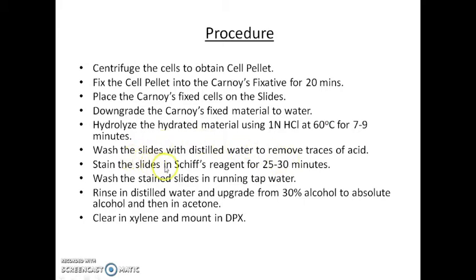After that, we stain the slides in Schiff's reagent for 25 to 30 minutes. Wash the stained slides in running tap water, rinse in distilled water, and upgrade from 30% alcohol to absolute alcohol and then acetone. Finally, we clear it in xylene and mount the slides in DPX.